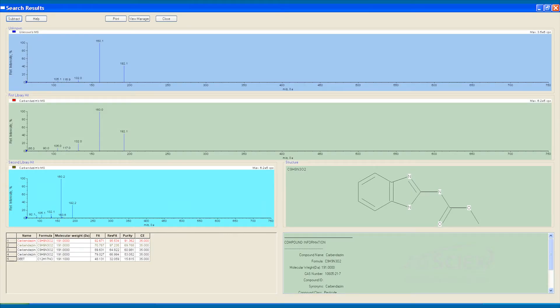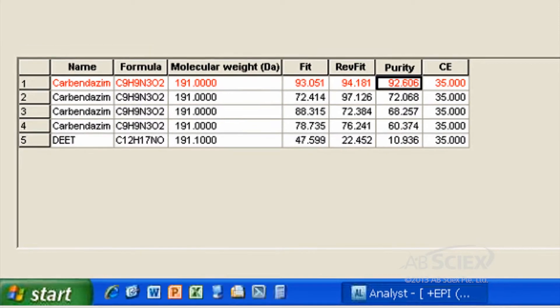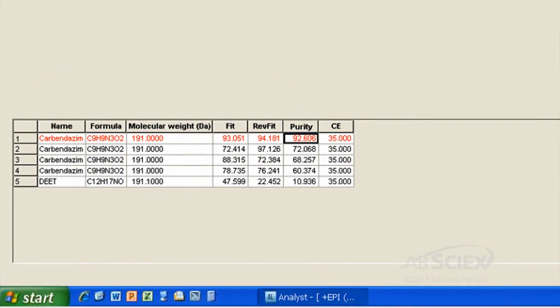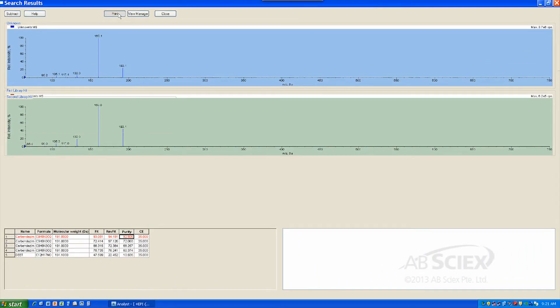Step 5: Review the Library Search Table. The key parameters of interest are the Fit, the Reverse Fit, and the Purity Score. High values for these mean good correspondence between your unknown spectrum and your library spectrum, giving you higher levels of confidence in the ID of that unknown peak.